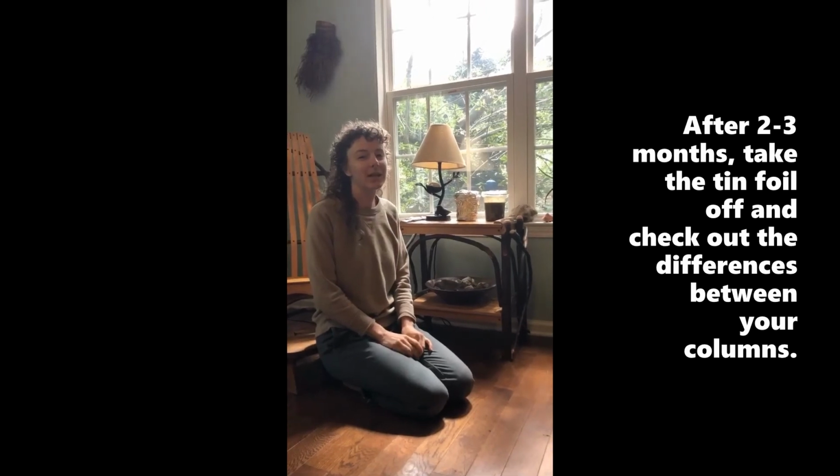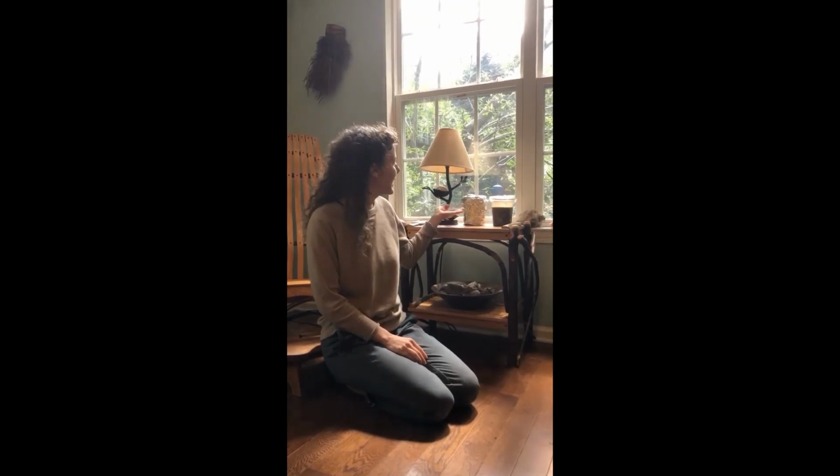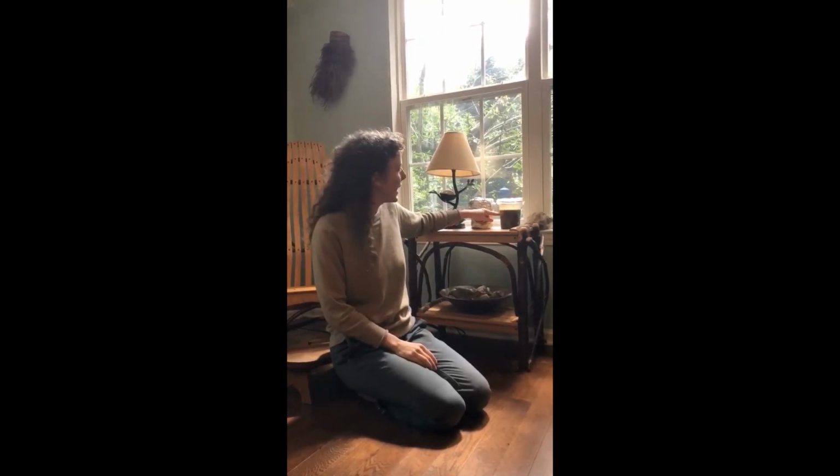Okay, so here we have our Winogradsky columns a couple of days after we made them. We put them in the sun, and some of the clay particles have settled out of the water, so it's gotten clearer, which is great because then we'll be able to see what's going on in there. We're just going to keep checking on the columns every few days, noting what they look like, and probably the first indication that microbes are growing in there will be bubbles. So keep an eye out for any little bubbles traveling through the water. That means your microbes are growing, and then over the next few weeks, you'll be able to observe some different changes indicating microbial life.